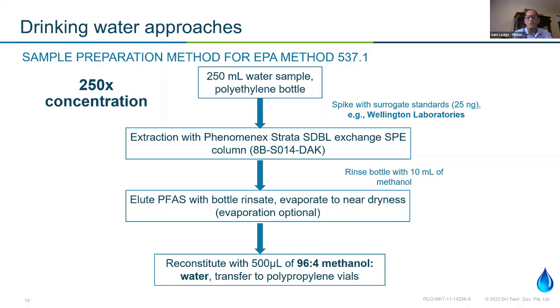So this obviously uses no buffer. It doesn't use any salts. It's just a reverse phase extraction. It's very simple. And of course, you see at the bottom that you have that 96-4 methanol water final volume, final solvent for your injection.